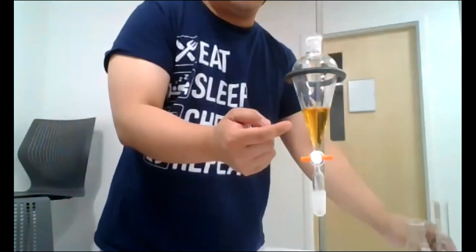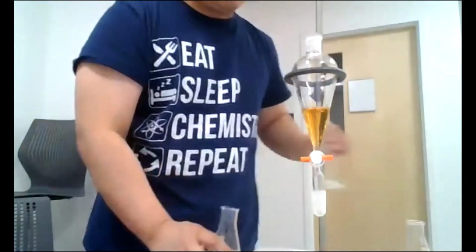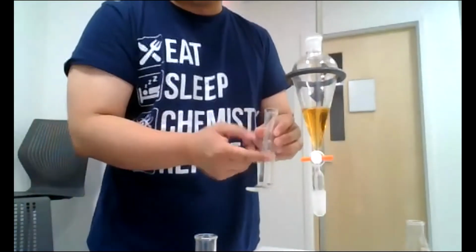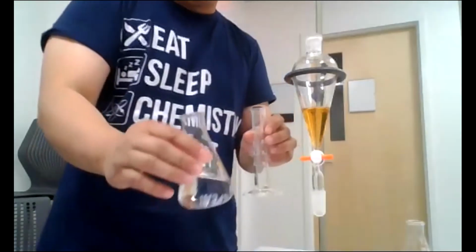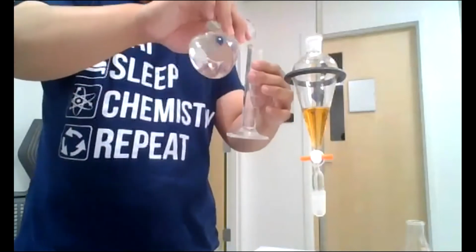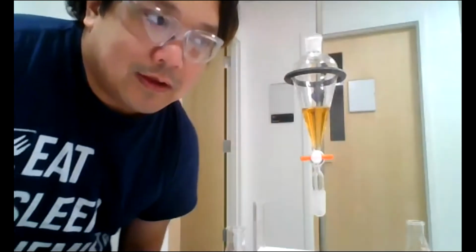So you see where the aqueous solution, aqueous water, and the cyclohexane is here. I could use the same graduated cylinder because I wanted all of that iodine solution in here anyway. So it's almost like rinsing your cup with more of your water, and try to get all the material into the separatory funnel. And what are we doing first? I think we're going to do the procedure where we use one serving of 20 milliliters of cyclohexane.